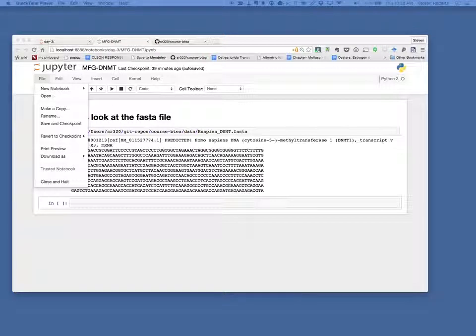But real quickly too, so how would we do this now? The first thing I would do is, RNA-seq data, I would get an assembly, okay? And the common kind of alignment of a bunch of reads is a SAM format, okay? S-A-M, that's the format, it's a generic format.